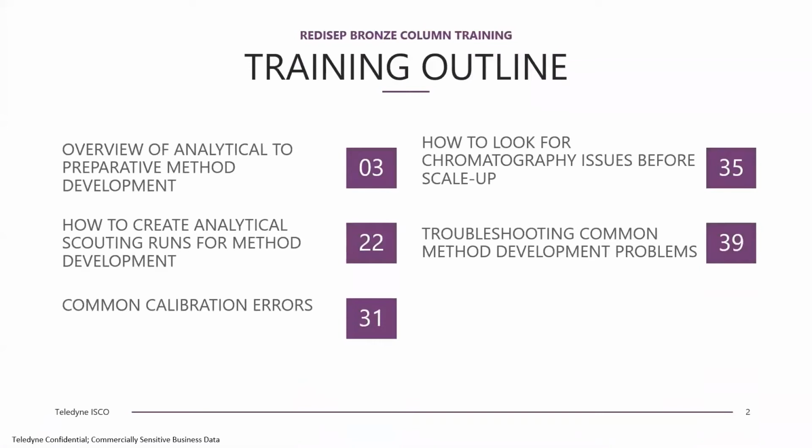Our training outline will include an overview of analytical method development, how to create analytical scouting runs, common calibration errors, how to look for chromatography issues before the scale up to the preparative system, and troubleshooting common problems.